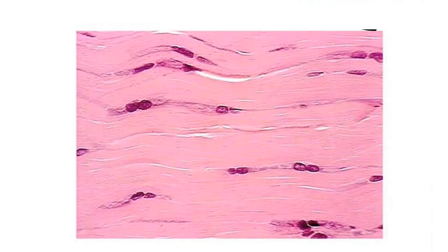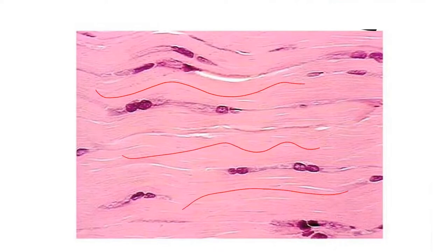Okay, what's the first thing that pops to your mind here? Wavy bacon, right? That's what we call this, wavy bacon, these long pink collagenous fibers in this wavy pattern. I know it's not actually bacon. This is dense regular connective tissue. What are these purple things? They're the nuclei of the fibroblasts that are making it. What's the function of this? Well, strong tensile strength, especially in one direction. Where would I find this? Something like a tendon or a ligament or an aponeurosis.